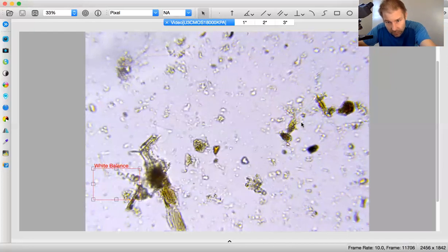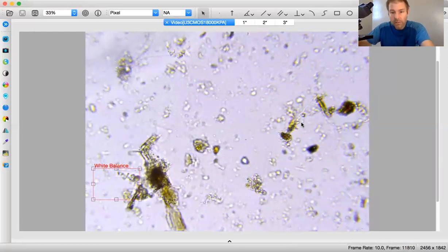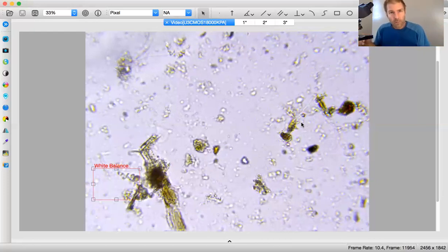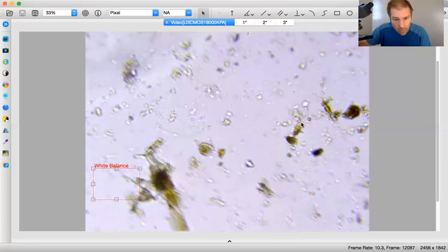I see 2 strands that are 1 and about 1.25. So we're just going to round that to 2. 2 and 1.5. So 3.5, and then 4.5, 5.5. So that would be 5.5. So that'd be 0.55. Wow, that's a lot of actino. 0.55.